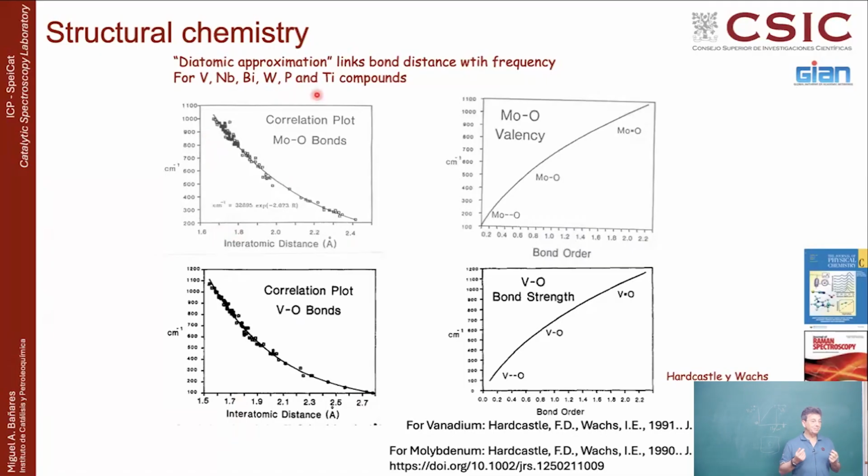How do you typically measure the distance between two elements? Which kind of technique can you use? Synchrotron-based techniques can tell you the distance between one nucleus and another nucleus. X-ray diffraction can tell you these things. But all these things require that you have a crystalline material, and that you get beam time to access a synchrotron. And now you are making these measurements in a Raman system within seconds.